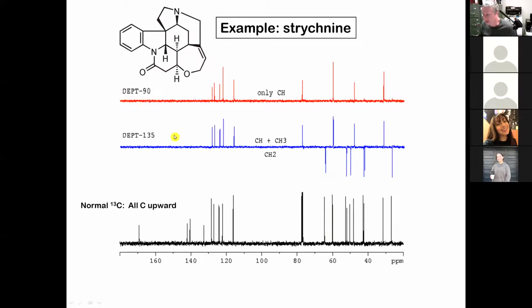That gives us the aromatic and the alkene. That's probably the 4 CHs, the aromatic and the alkene. And then we see those CHs up here. And then what are all the new peaks that are pointing down? Those must be the, what?